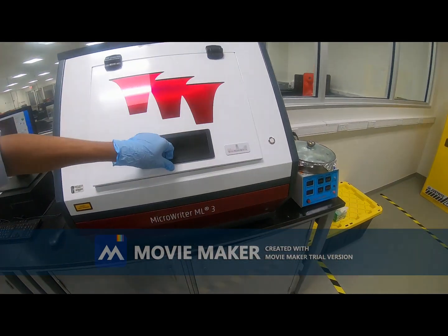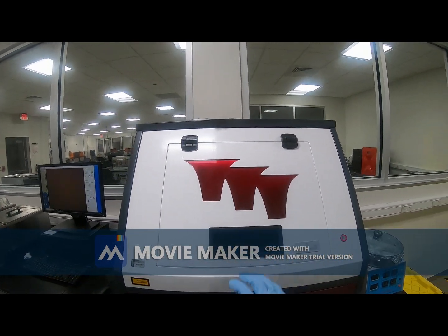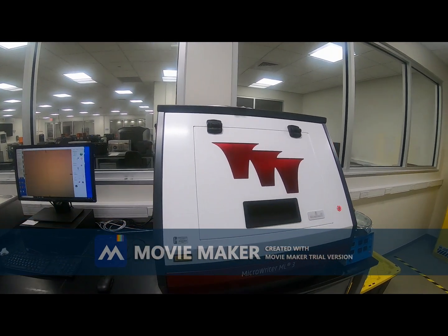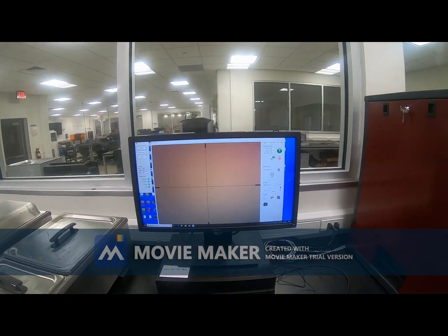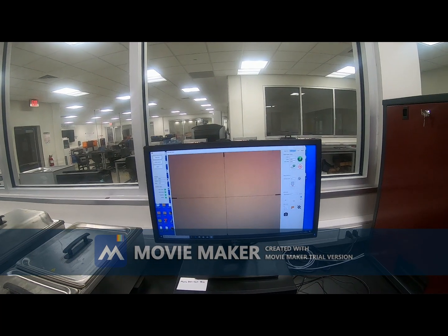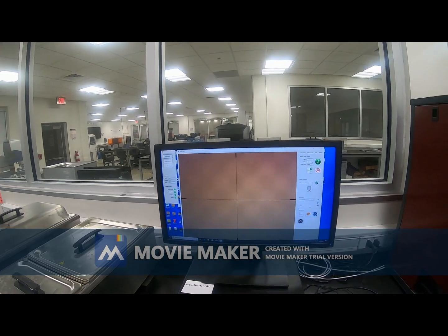After that, I will press this button again. It will close this lid, and there is a Z direction stage which exposes the UV light that came into the right position. After that, I will come back to this computer, and here there are 3 steps: align wafer, prepare pattern, and expose. At first, align wafer, I need to click here microscope and click here focus assist. It will take a few seconds to focus the actual plane.